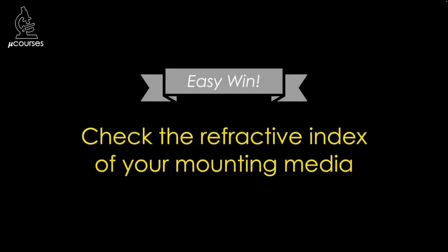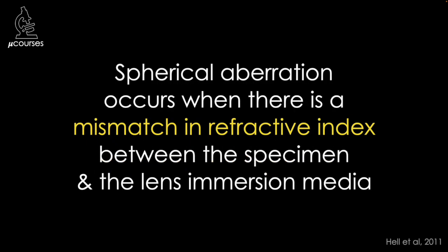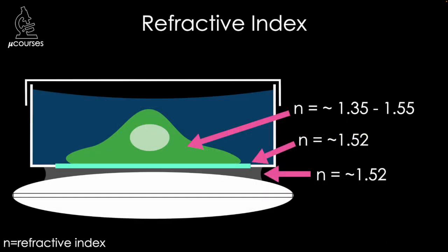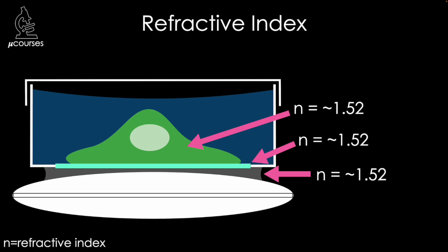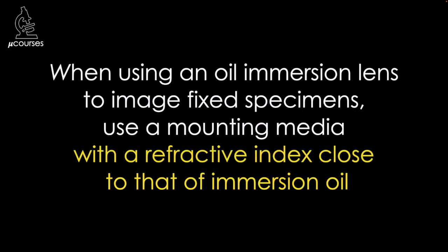Another easy win is to check the refractive index of your mounting media. Spherical aberration can be reduced by matching the refractive index of the specimen to the immersion media. This is tough if not impossible with live specimens, but when using an oil immersion lens to image fixed specimens, you can use a mounting media with a refractive index close to that of immersion oil. See the description box below the video for examples of mounting medias designed to achieve a refractive index similar to that of immersion oil.